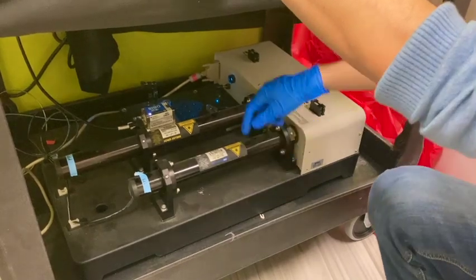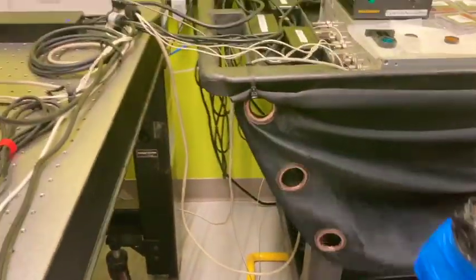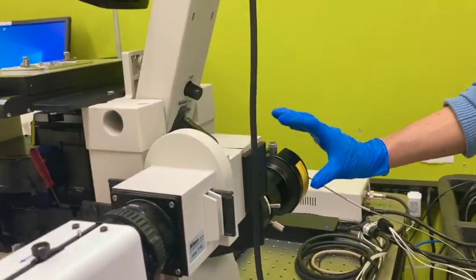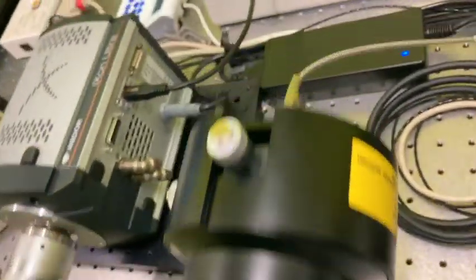And then if you go out in this fiber, so this is our illumination. All these 3 lasers will go out in this fiber, and then it connects to the TIRF module in the microscope, and will go into the microscope, and then it can reflect up.